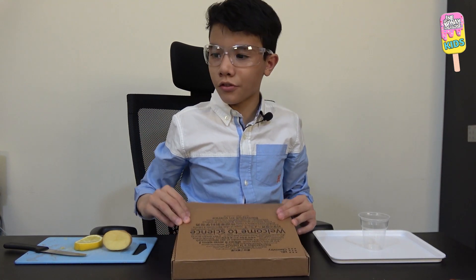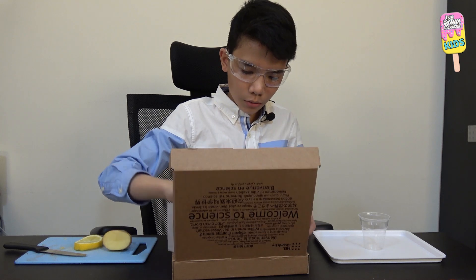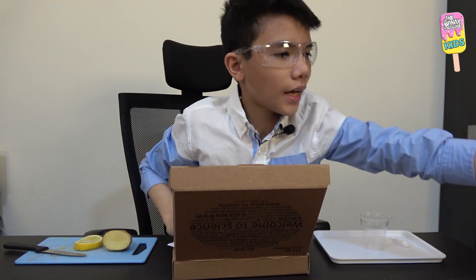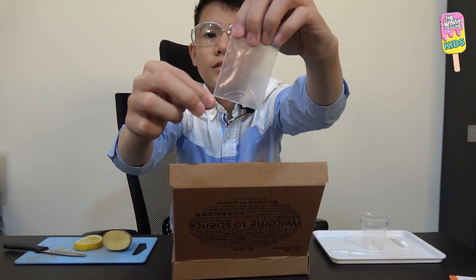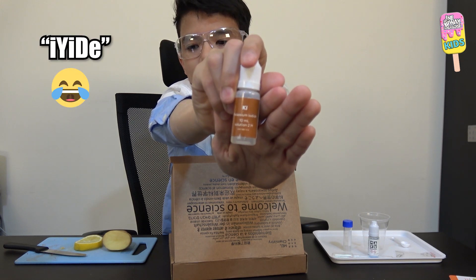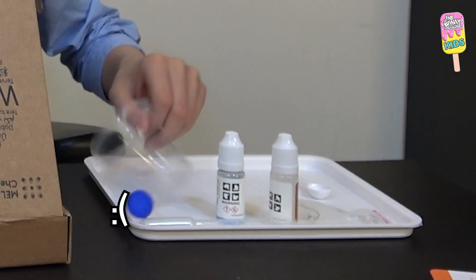From the set, I'm going to take a double-ended measuring spoon, some protective gloves, a pipette, a pin opener, a plastic vial, some copper sulfate, and some potassium iodide. And those are all the things we need.